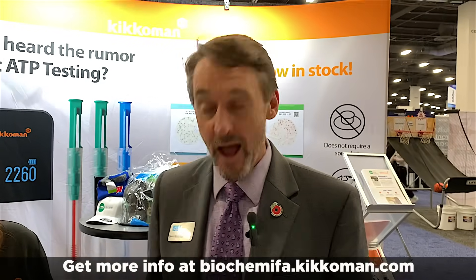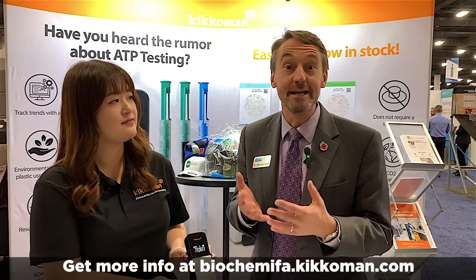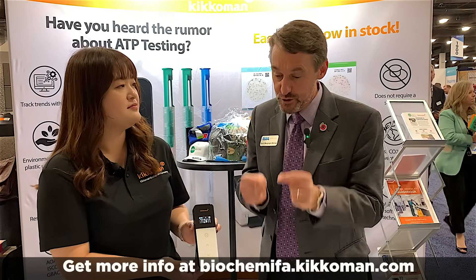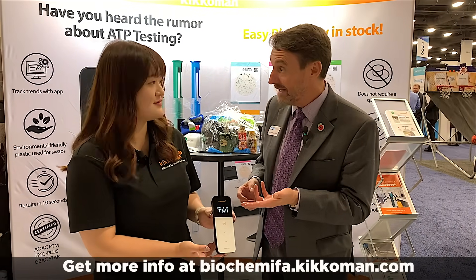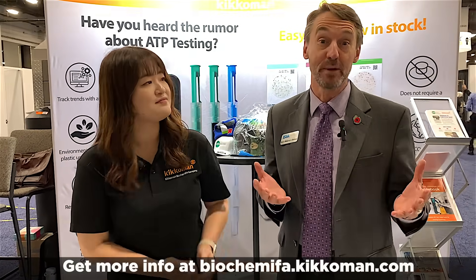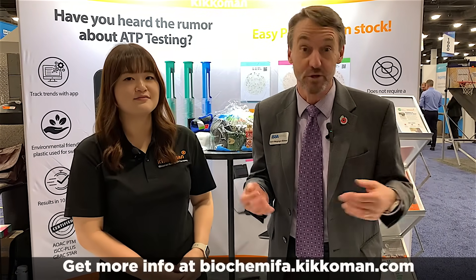That number is really dirty. And the point we're making here is that as a professional cleaner, cleaning is removing. You have to know what you're removing, and more importantly, you have to know that what you're doing to clean the surface actually works. So this is the before-clean reading, and then we clean it and get an after-clean number, and we can actually measure what we're doing for health and safety and how good we are at cleaning, which is removing.